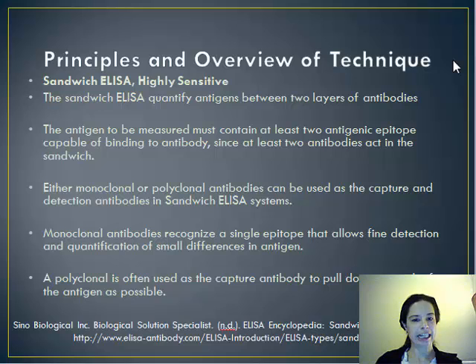So our technique today is going to involve sandwich ELISA. It's a very highly sensitive technique. It involves quantitating antigens that are bound between two layers of antibodies.